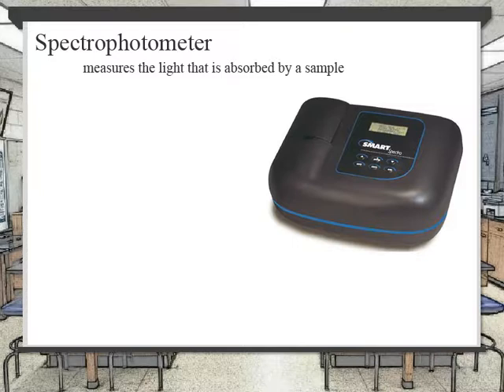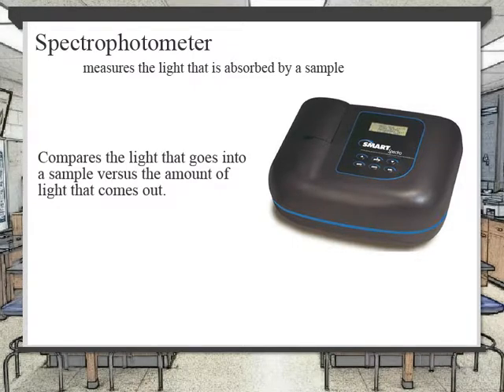In this lab, you will be using the Bradford protein assay to quantify or measure the amount of protein that is in solution. This assay is based on different forms of Coomassie Brilliant Blue dye.